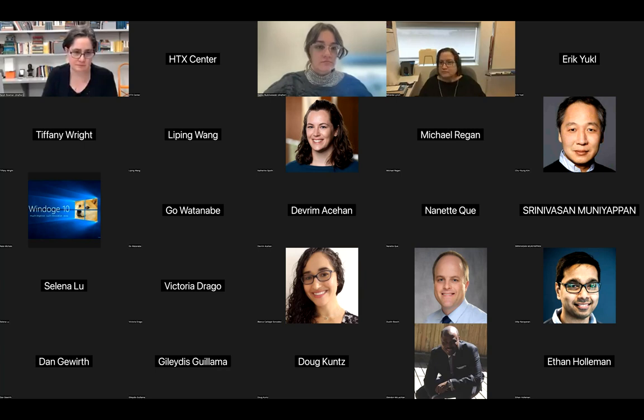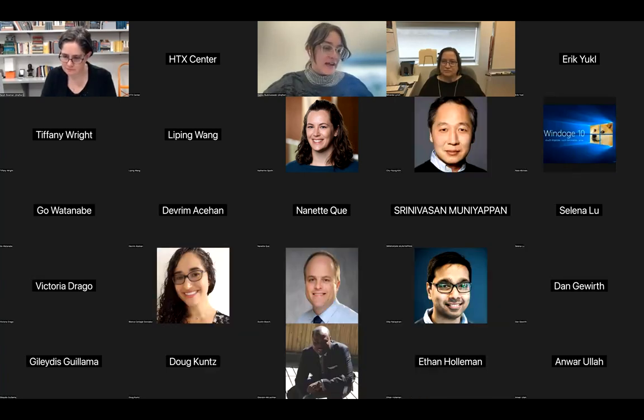So I guess I can start on this one. Everyone has their different approach for how they like to do optimization. But how I like to start, after I have a hit, or say 5 hits from a screen, is look at the conditions and compare between them. Do I see any commonalities? Is there something that keeps showing up in these conditions that I should incorporate into my optimization?